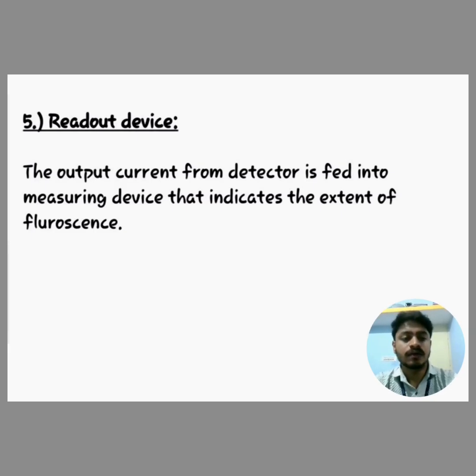Then the applications of this fluorescence spectrophotometer. The first application is that X-ray fluorescence is useful for the analysis of metals and non-metals with atomic number greater than 12. With special equipment, elements of atomic number 5 to 11 can also be analyzed. From this fluorescence spectroscopy, qualitative analysis can be carried out by measuring the angle of diffraction of the fluorescent X-rays.